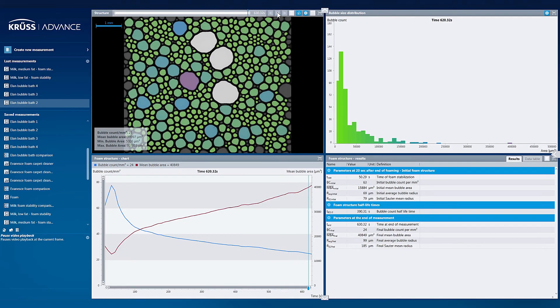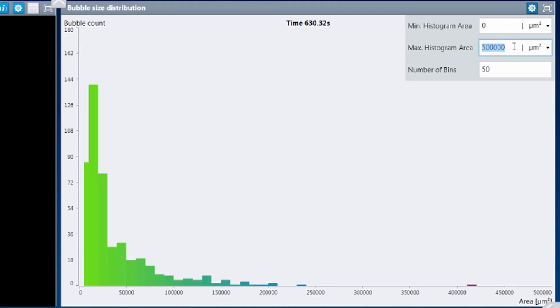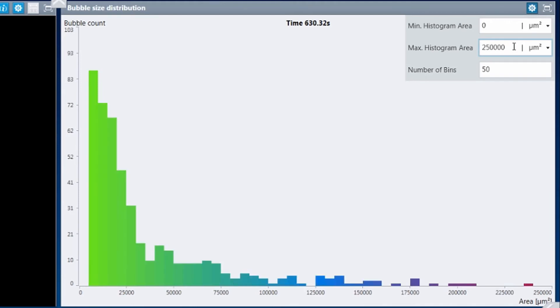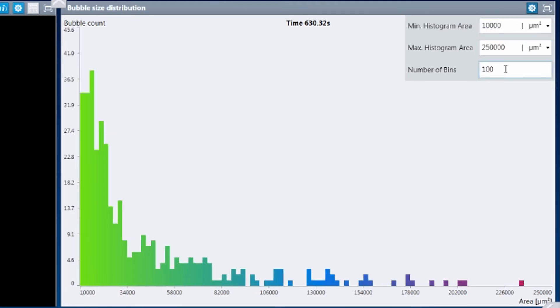The bubble size distribution graph is especially flexible, allowing you to choose from many different options which maximize your analysis of the data.